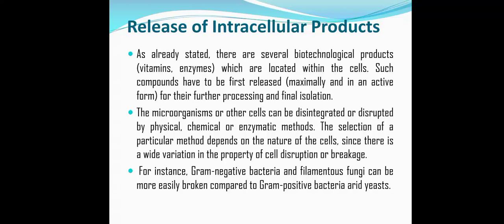Now there are various types of products which are synthesized inside the microbial cells. They may be vitamins or enzymes. Majorly, as these products are synthesized within the cell, for their extraction and purification it is initially important to release this intracellular product from the cells.